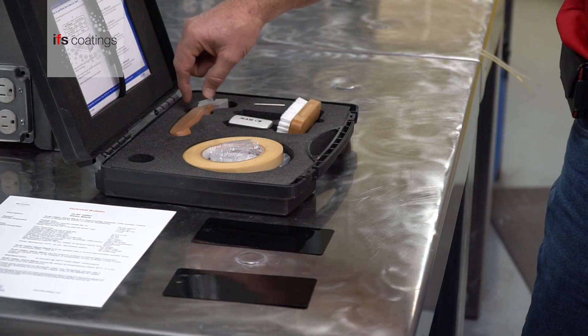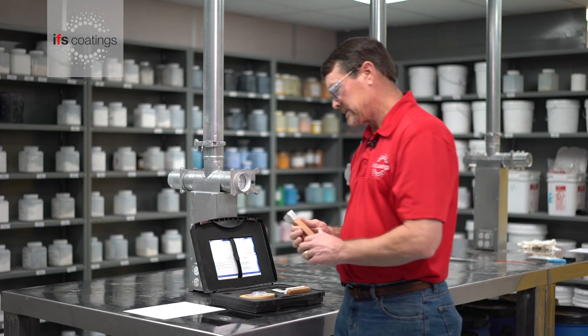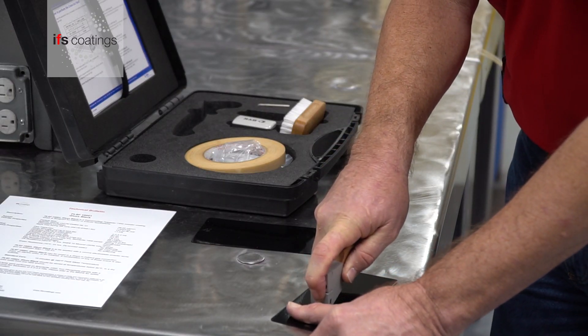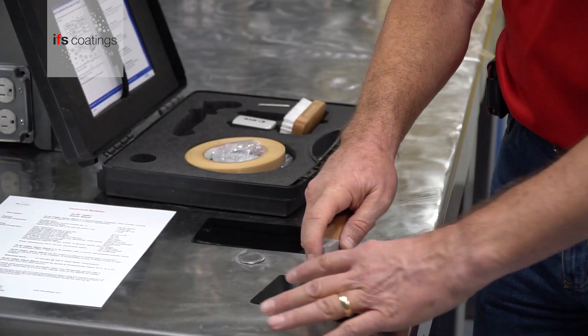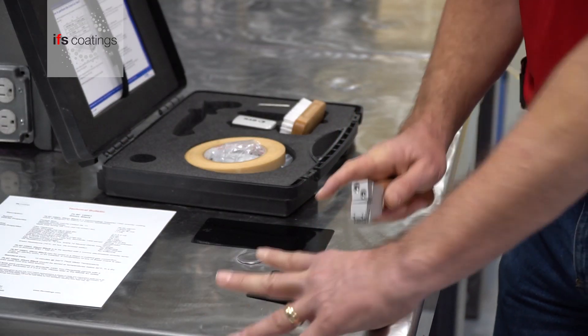With that you will actually take this crosshatch device and going down to the substrate you'll make a crosshatch — or I would say a tic-tac-toe — scribe across the surface.